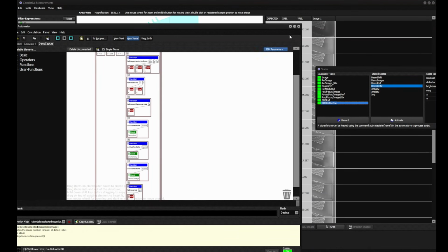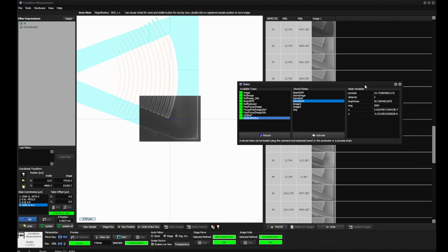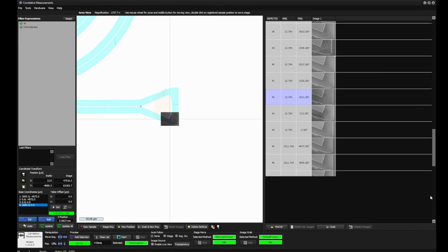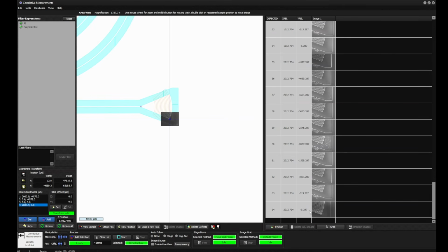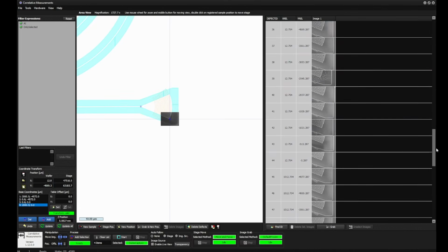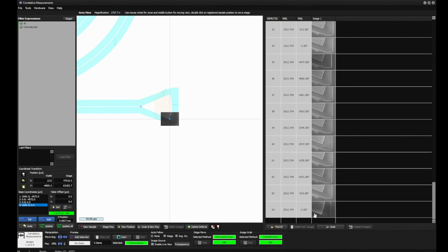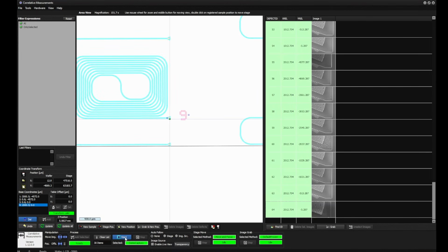We replace the current recipe and just try it. Need to select all these positions, of course, from there to there, and then add it to the, oh no, this one here we don't want. Yeah, we do it again like that and that. Add 30 items. Yeah, that's correct. And we just press start.